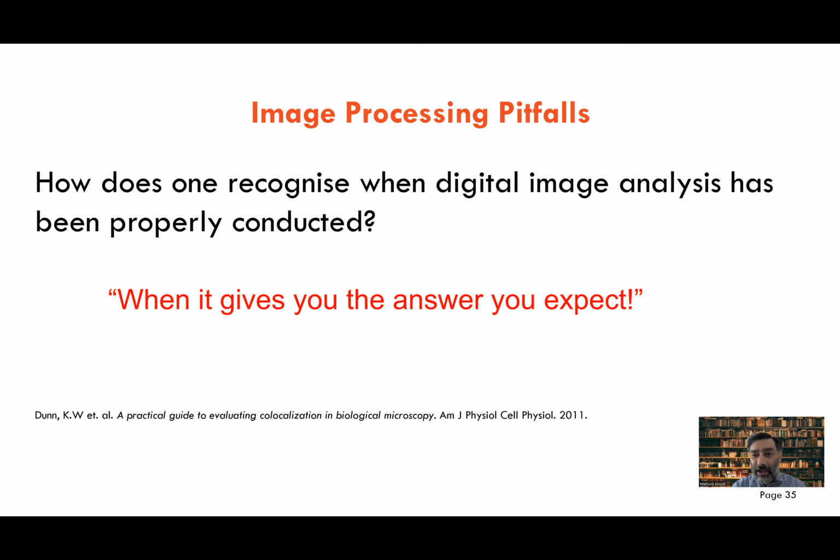So how about we take a break and then we jump onto the Jupyter notebook.